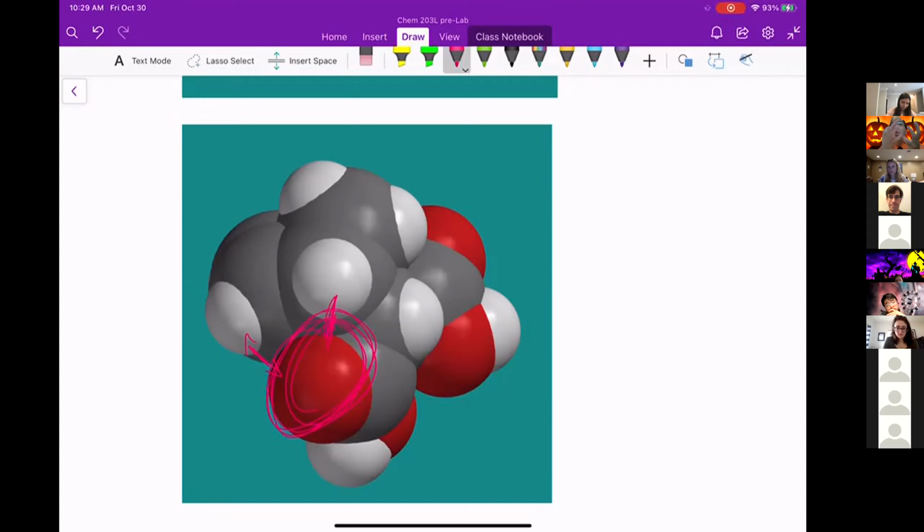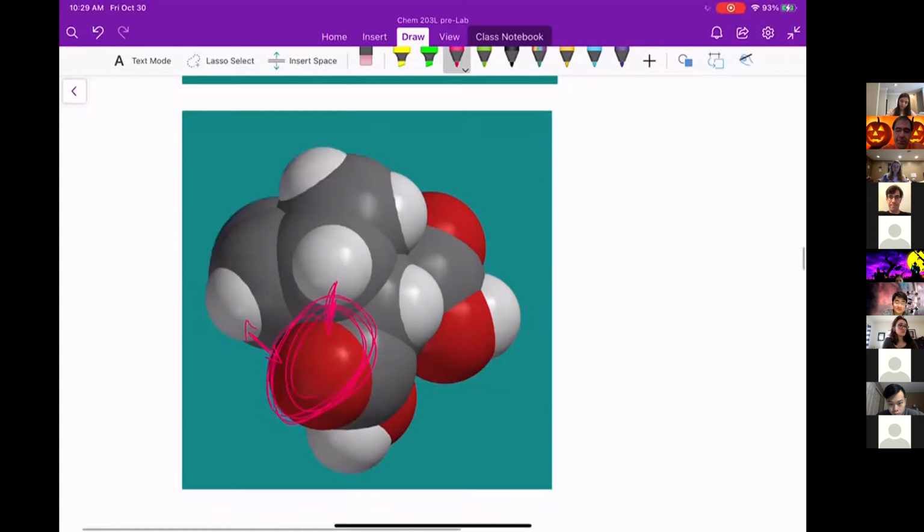The take-home message I want you to get here is that NMR has more information. The three-dimensional arrangement can also affect the number of signals that you see. You can get splitting because of through space interactions, not just through bond interactions. Okay, that's kind of my big thing there. And these are all Diels Alder adducts.